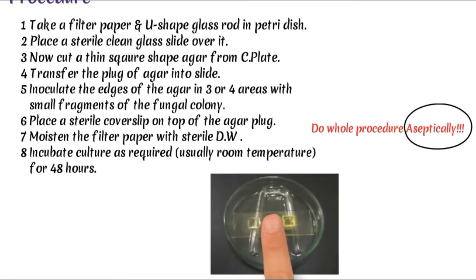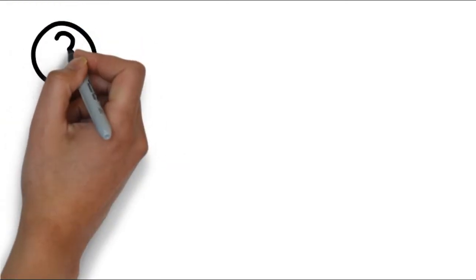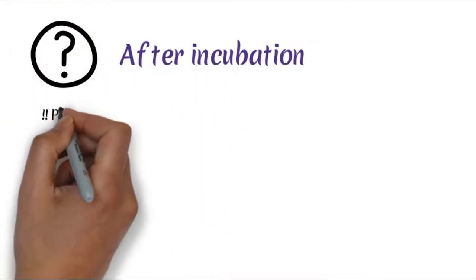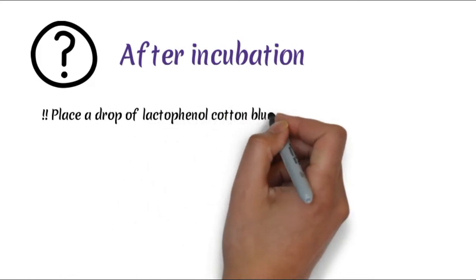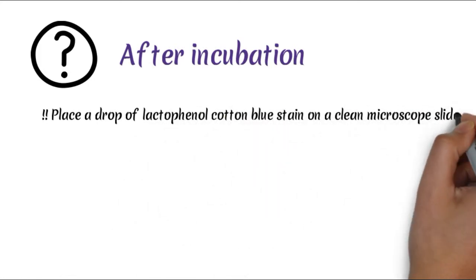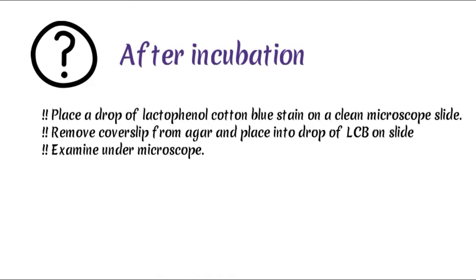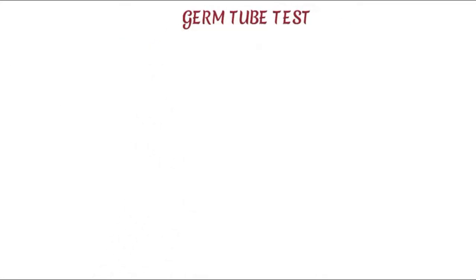After incubation, take a drop of LCB stain on a clean microscope slide. Remove the cover slip from the agar and fix it with alcohol. Put a drop of LCB on the slide and examine under microscope.